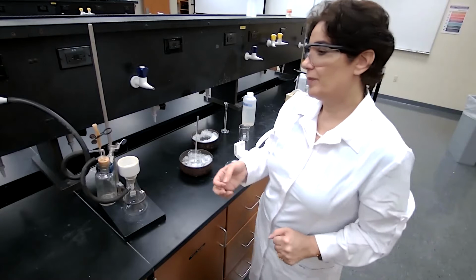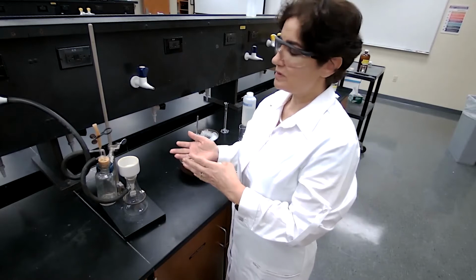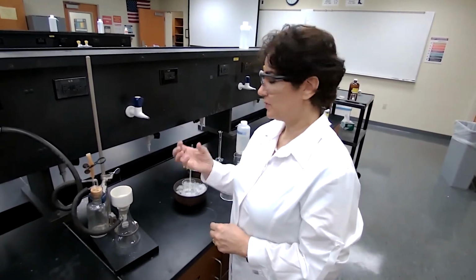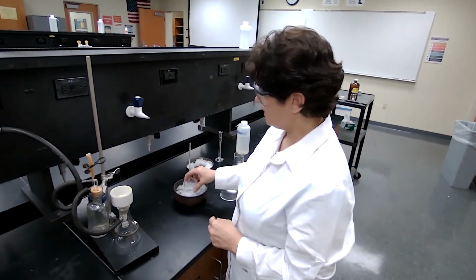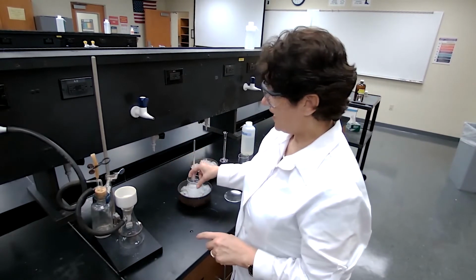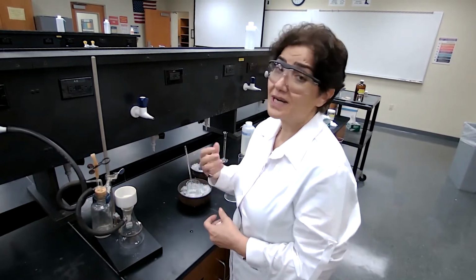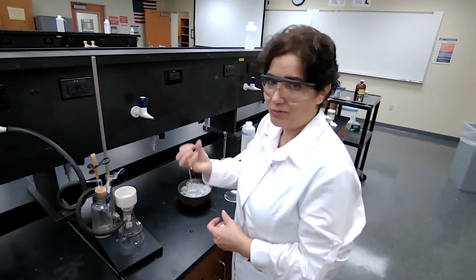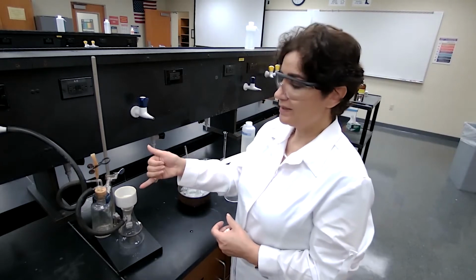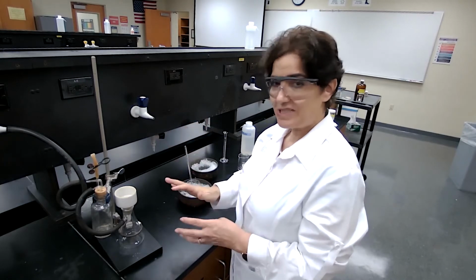I want to also repeat how to use vacuum filtration. Anytime you have a mixture of solid and liquid and you want to keep the solid, you would use vacuum filtration. When you have a mixture of solid and liquid and you want to keep the liquid, you would use gravity filtration, because you want clean liquid only. You don't want to force anything.